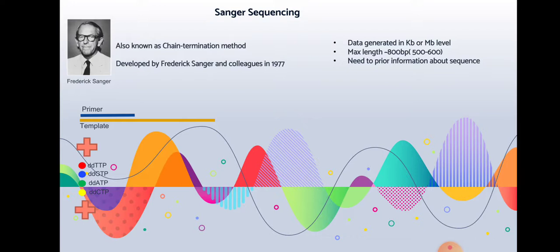Once we mix these chemicals in a buffer solution and perform PCR amplification, we will get DNA fragments which are tagged with fluorescent molecules. I will load this PCR amplified product into the Sanger sequencing machine, where it will get segregated by molecular weight and it will look something like this.